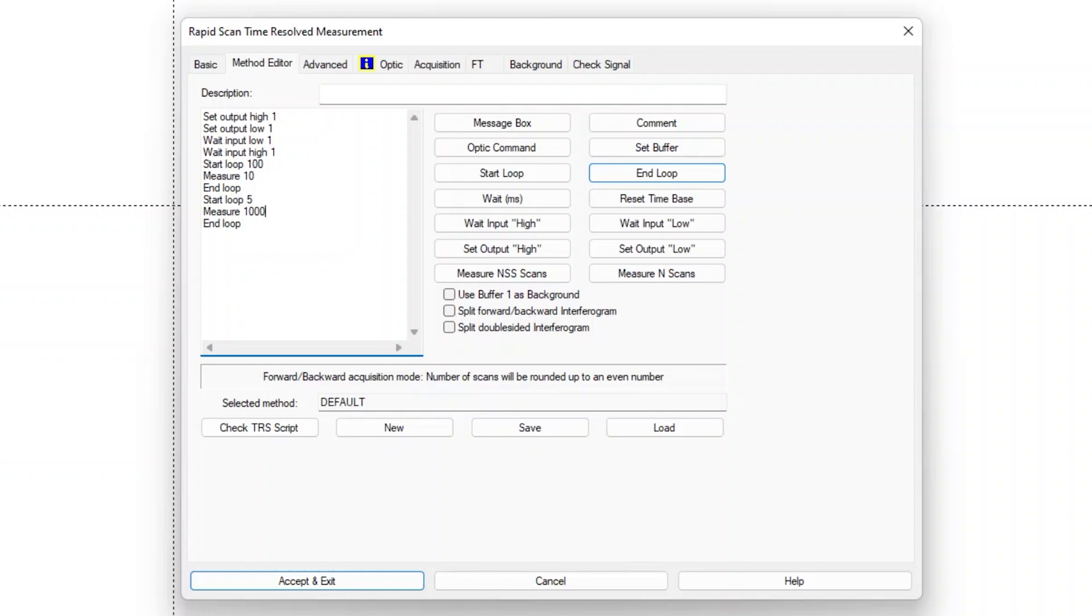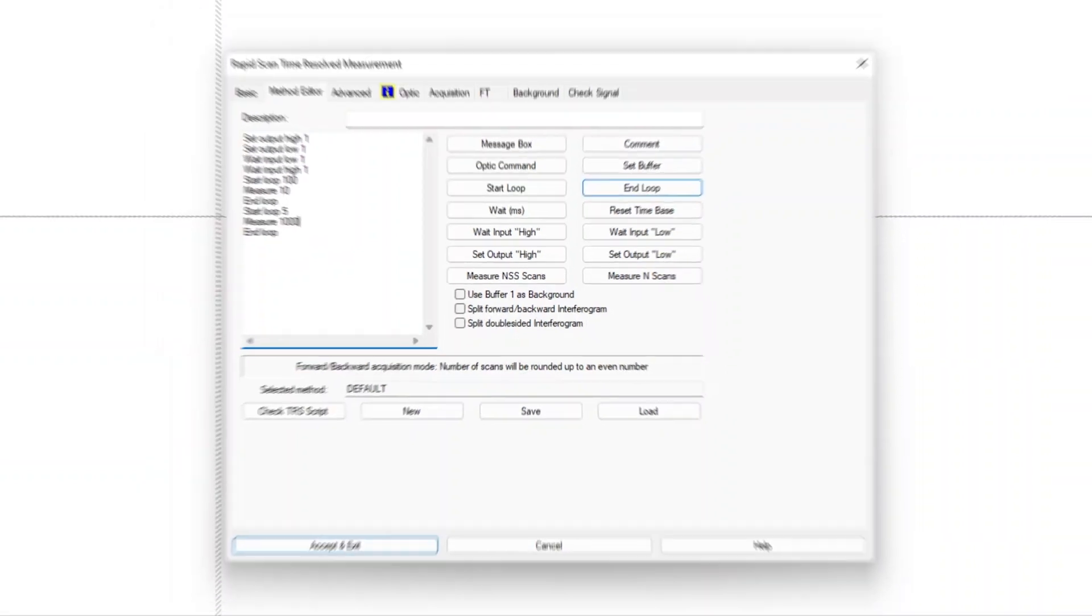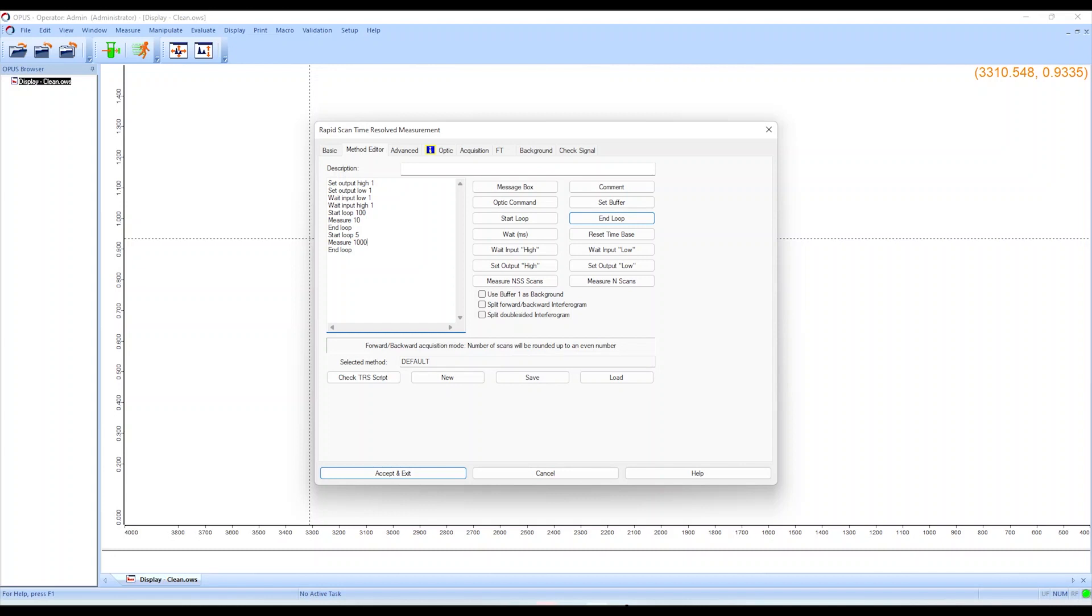All spectra will be then presented in one 3D plot. More details about RapidScan method editor can be found in another video listed below.